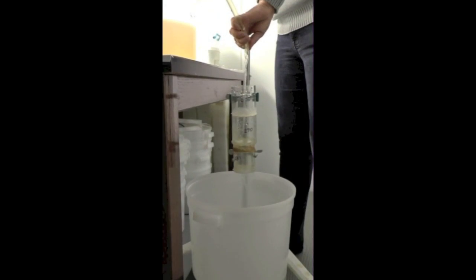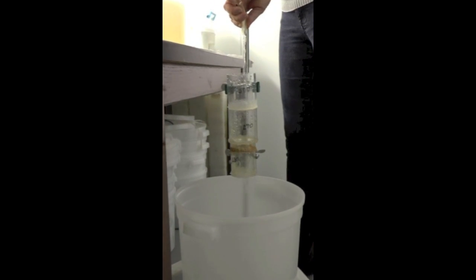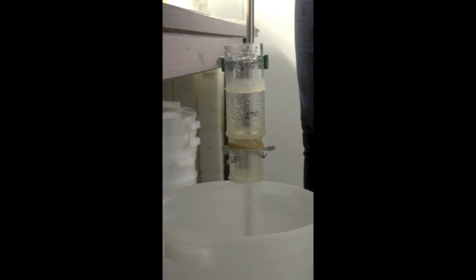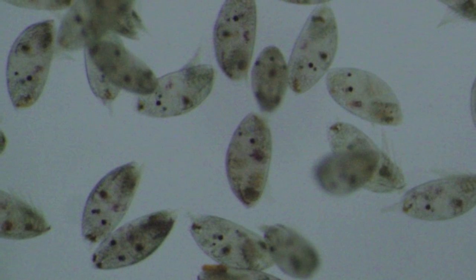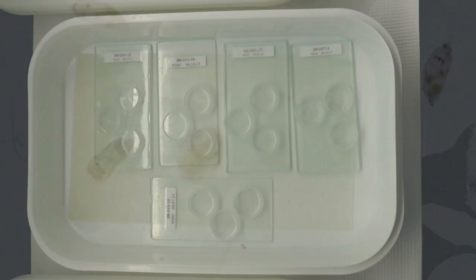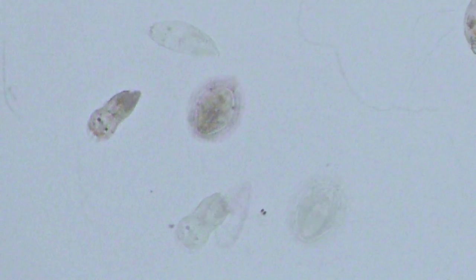When nauplii molt into cyprids, they are strained through 300, 270, and 230 micron nylon mesh filters. There will only be nauplii in the first filter, nauplii and cyprids in the second, and only cyprids in the last. The cyprids are then kept in the refrigerator for 2 to 3 days at 4 degrees Celsius before they are placed on glass plates covered with a silicone film. The cyprids will then glue down and metamorphose into young barnacles.